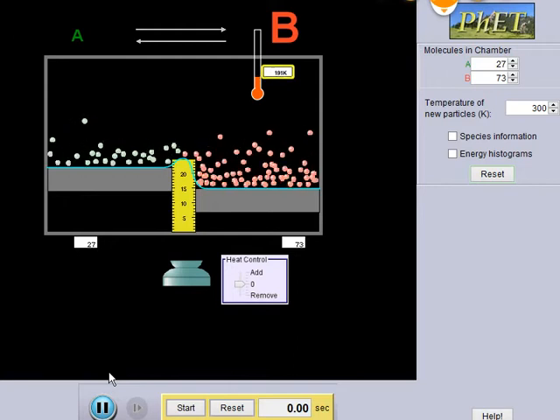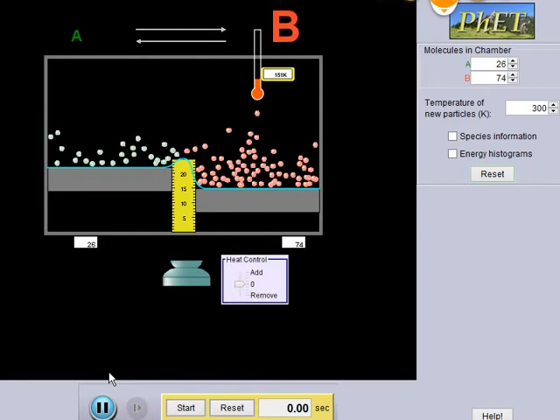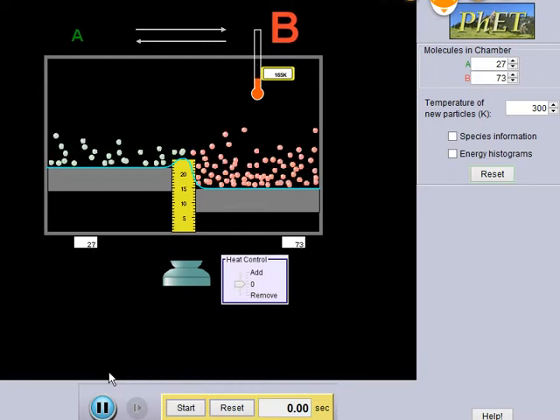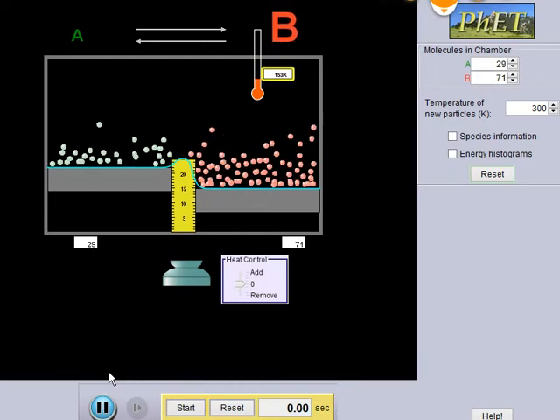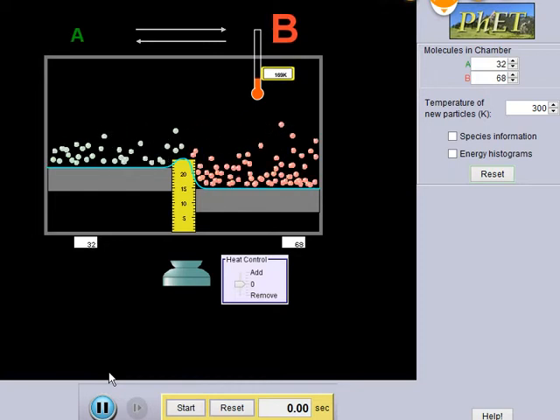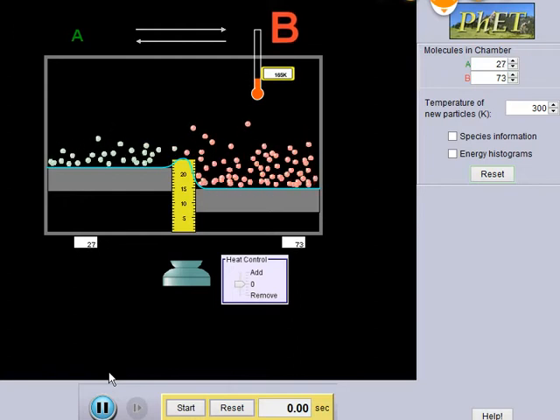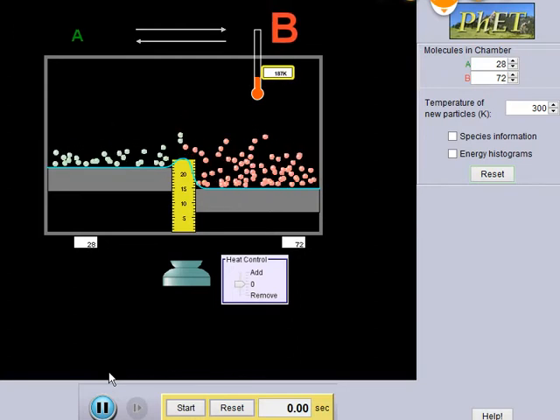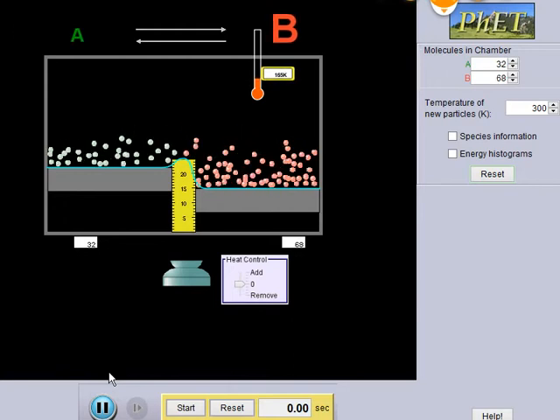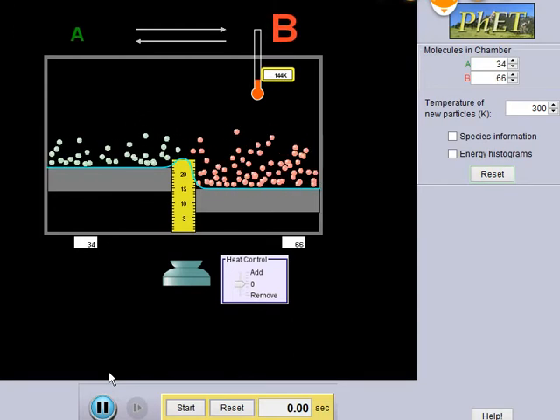Yeah, let's wait. That's what I'm saying. You guys are going to have to be extremely patient with this lab, which is why this lab has tiny experiments, but they take time. They actually take time to do, as you can see. So Q, you guys understand Q? Q is basically the reaction quotient, and it tells you the extent of the reaction. How? The same expression as K, but instead of the equilibrium concentrations, I take concentrations at any other random point in time. Is that clear?